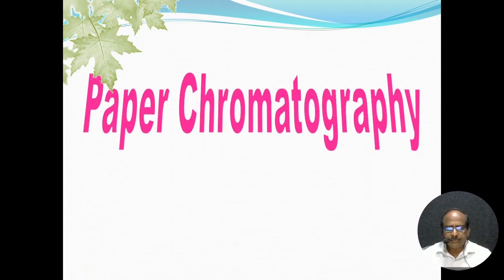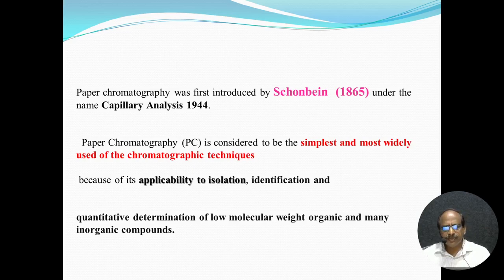Today we will discuss paper chromatography. In the previous classes, we discussed the general chromatographic techniques, the Rf values, and the two different phases: the mobile phase and the stationary phase. Today we will discuss paper chromatography, and how it was introduced globally.